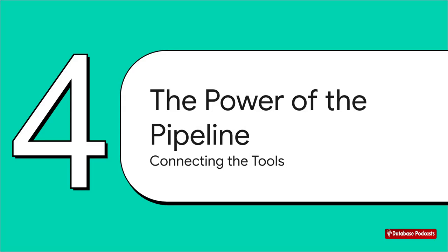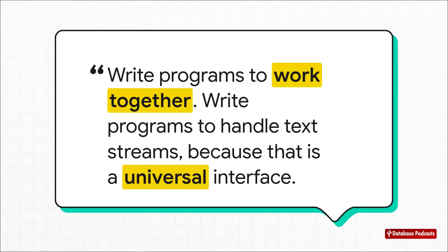So we have Bioawk to extract and Sed to edit. But the real game changer, the thing that makes this whole approach so powerful, is when we ask, can we chain them together? Can we build a whole multi-step workflow? And the answer is a resounding yes. That question really gets to the core of the whole Unix philosophy, which is captured perfectly in this quote. The idea is simple. Create small tools that each do one thing really, really well. Then connect them using pipes to build powerful, custom workflows. It's like building with Legos.